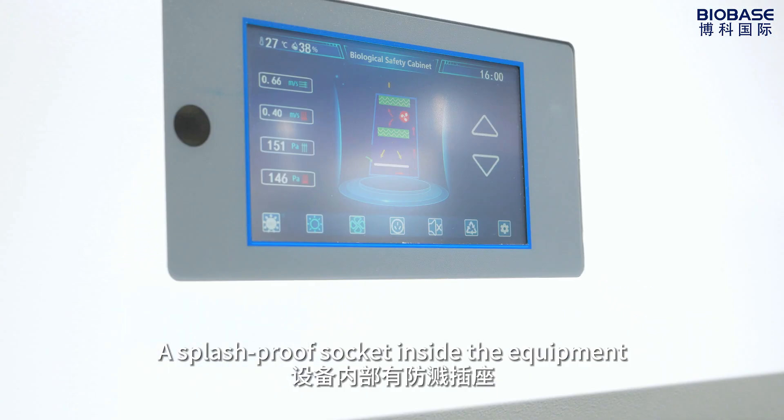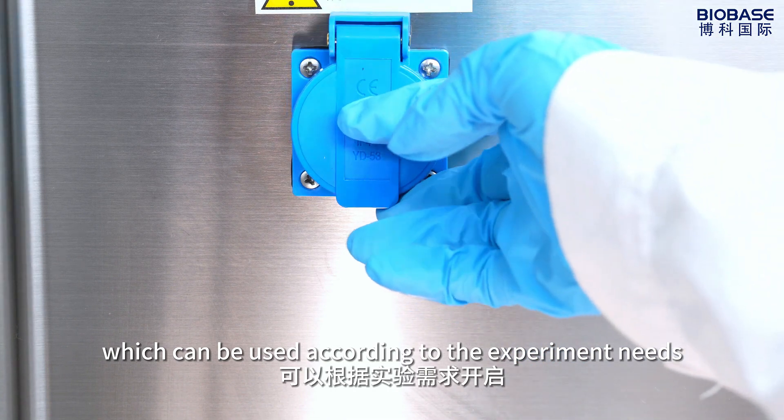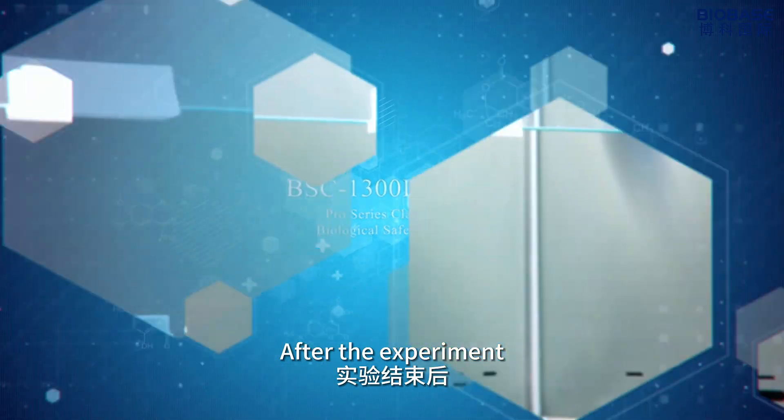There is a splash-proof socket inside the equipment, which can be used according to the experimental needs. After the experiment is complete, proceed with sterilization.